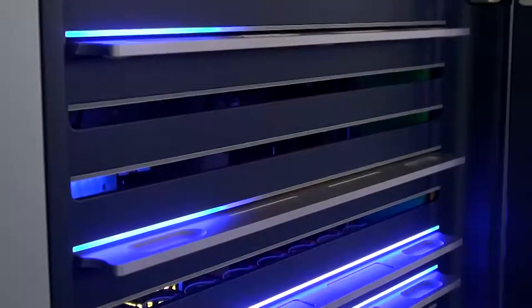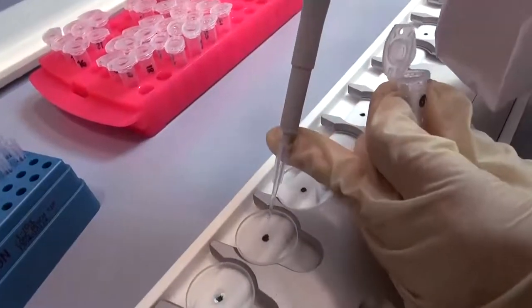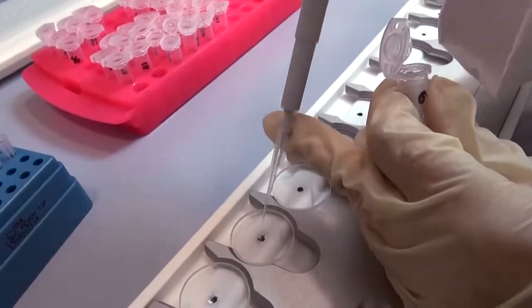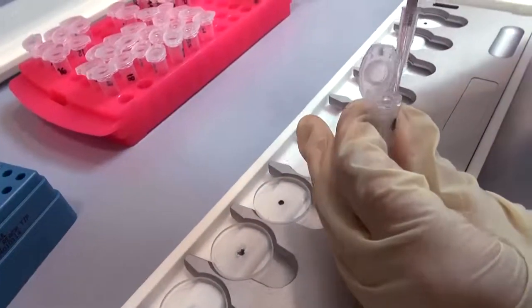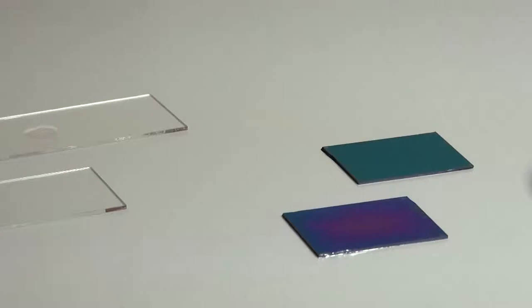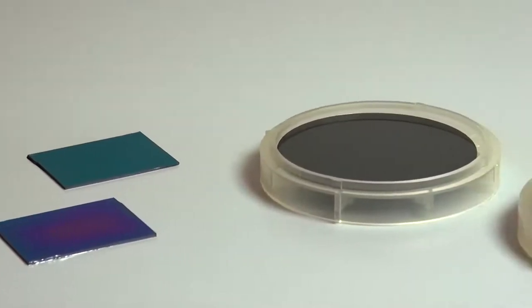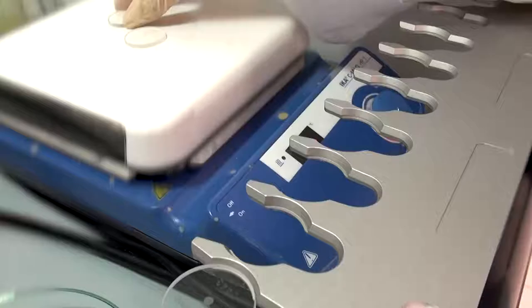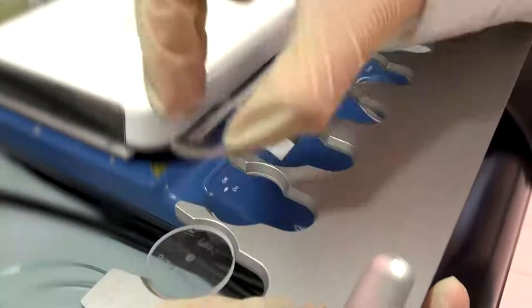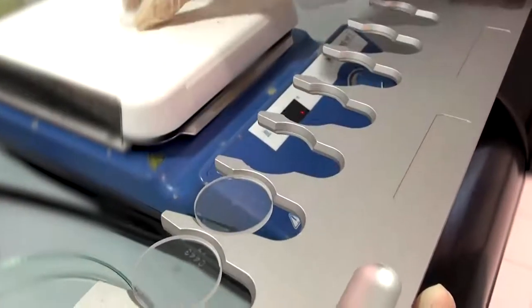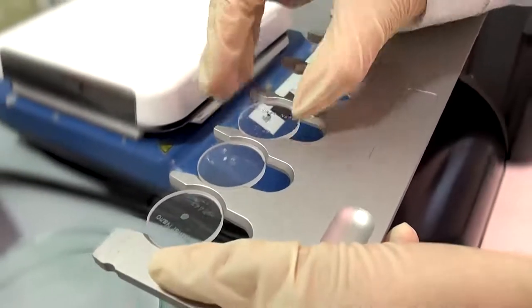Depending on the application, dedicated trays are available for different kinds of reflective sample carriers, such as quartz discs, microscope slides, or silicon wafers. This unique flexibility makes the S4 TSTAR a most versatile tool for the analysis of a multitude of sample types.